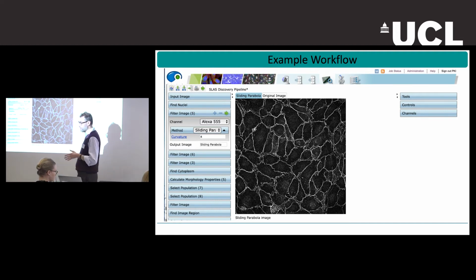And then, as I told you before, one interesting question was to characterize the continuity of this junction. In the previous work, we basically counted the number of particles which pertain to each cell. You will see later how to make it. For now, let's go on with find cells. Finding cells with this staining is not extremely straightforward, so we need some pre-filtering of the image. This is what you have done here, and basically take it as it is, and then perhaps we dwell a little bit more into the details.